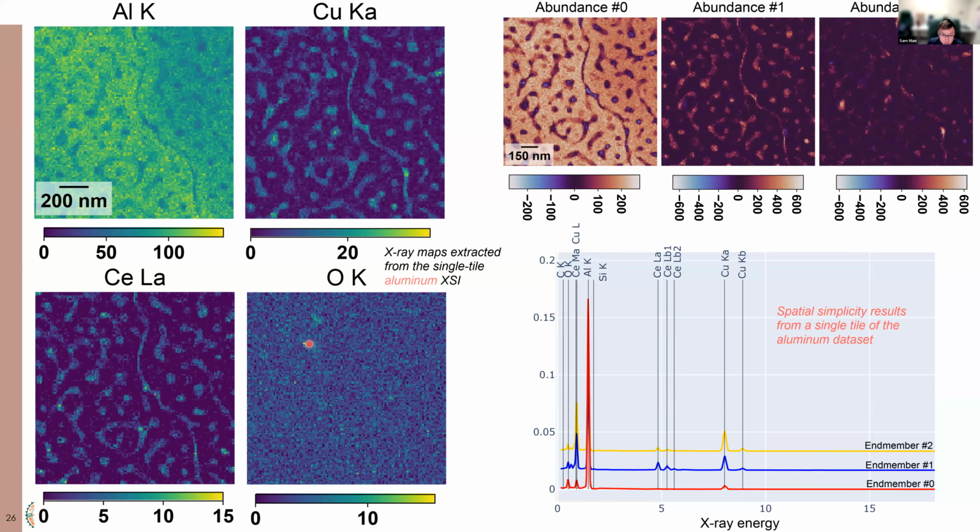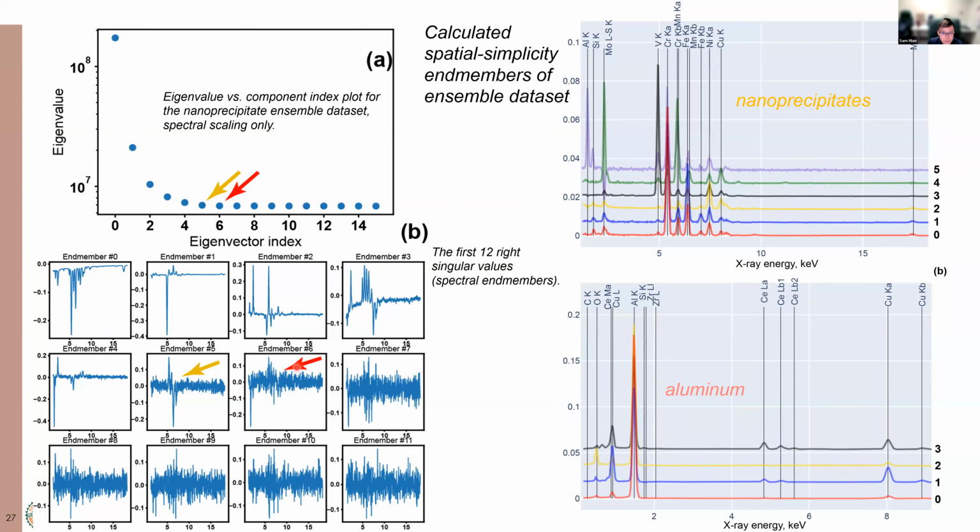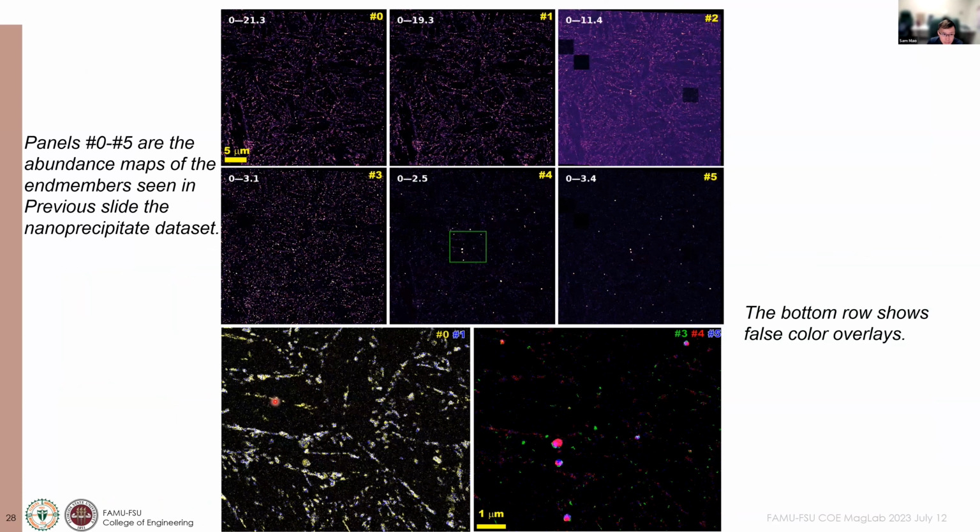This method is very useful, especially when you are zooming in and then stitching them together, and using machine learning methods to extract all these nanoscale features. These are just some things from the eigenvalue plot, so you'll be able to see different spectra numbers for the ranking. This last one is actually very helpful.